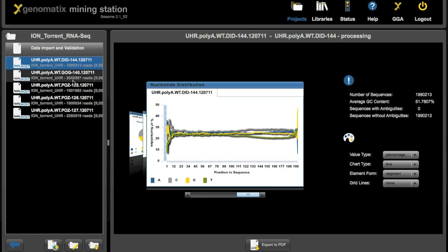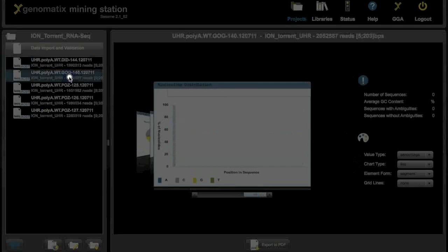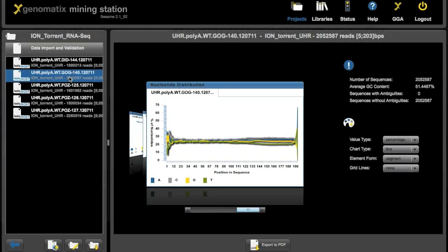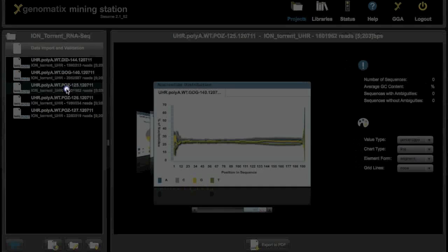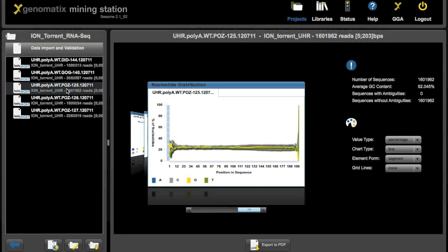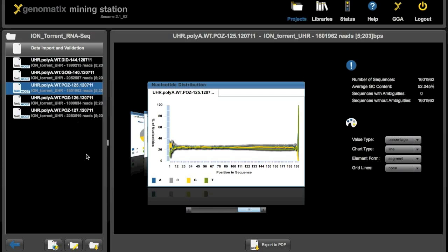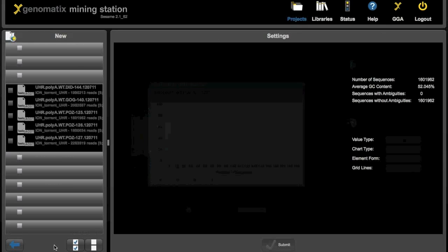If we want to see these statistics for any of the other files we imported, we can just click on the files here on the list to the left and the statistics will pop up. Now let's start an analysis on these files.